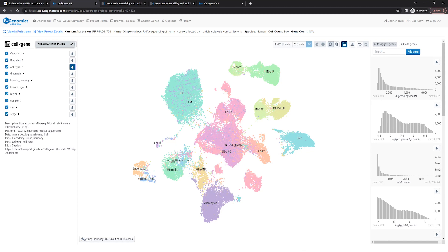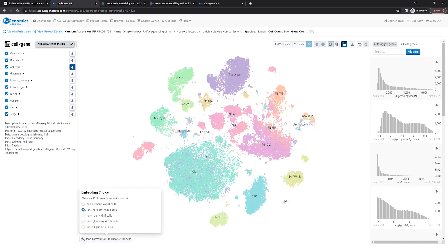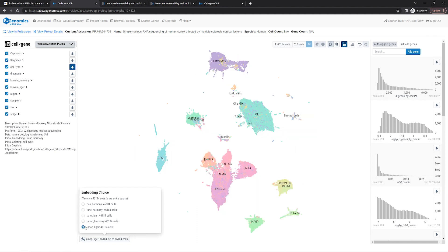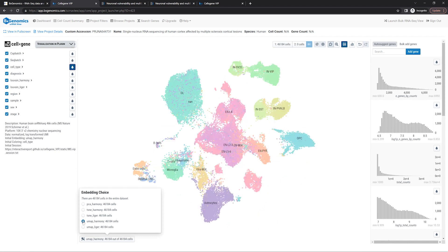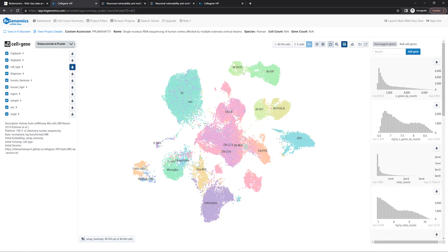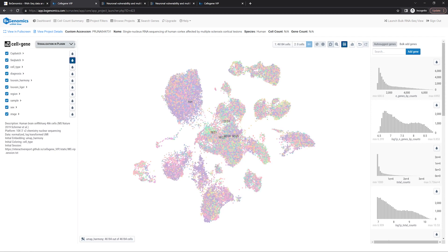We can change the embedding options from UMAP to TSNE, or we can view batch correction using the LIGER method instead of Harmony. For this project, we'll choose UMAP of Harmony results as the default embedding. By default, the cells are colored by cell type. We can change the coloring to sequencing batch, and here we can see that the Harmony method did a good job of removing any batch effect.